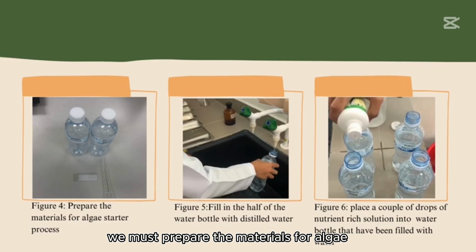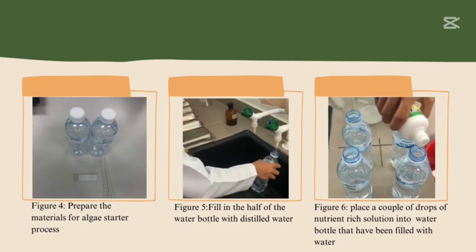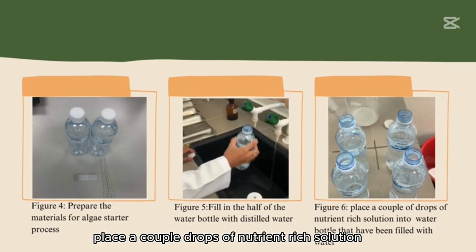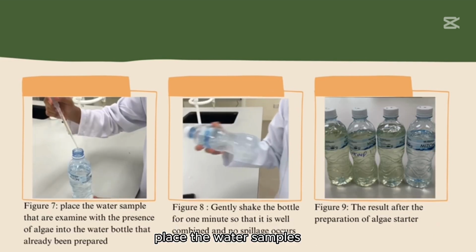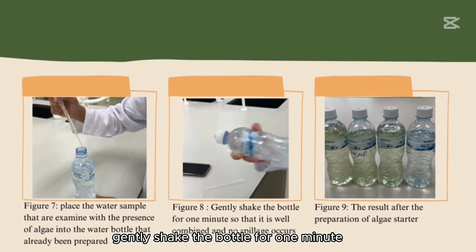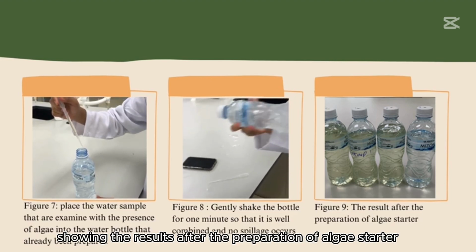Next, we must prepare the materials for the algae starter process, which are 4 water bottles, a pipette, and water samples of algae. Next, we're going to fill half of the water bottle with distilled water, and then place a couple drops of nutrient-rich solution into the water bottle that has been filled with water. Place the water sample that was examined with the presence of algae into the water bottle that has already been prepared. Gently shake the bottle for 1 minute so that it is well combined and no spillage occurs. Figure 9 shows the results after the preparation of algae starter.